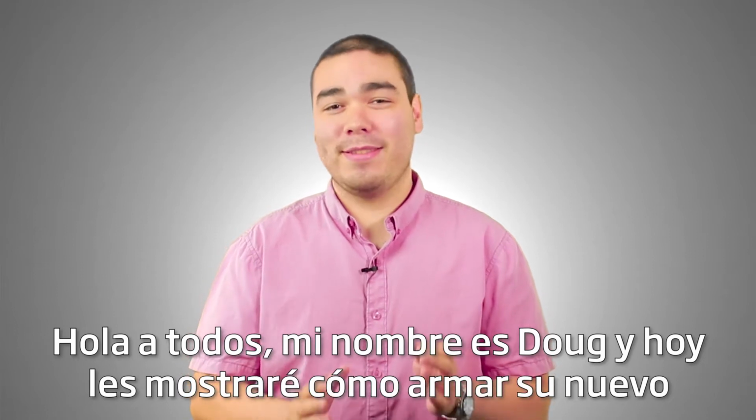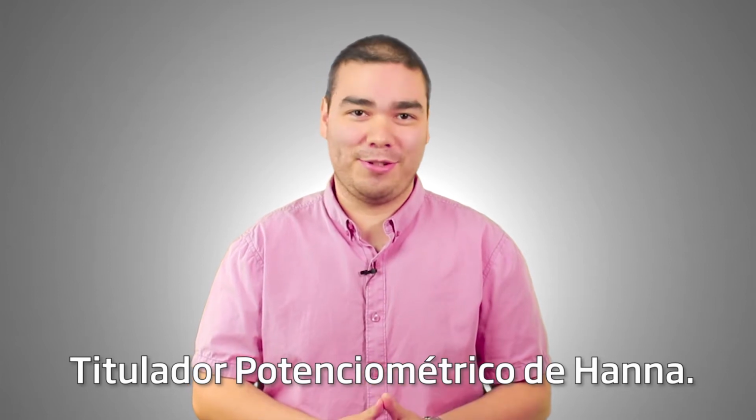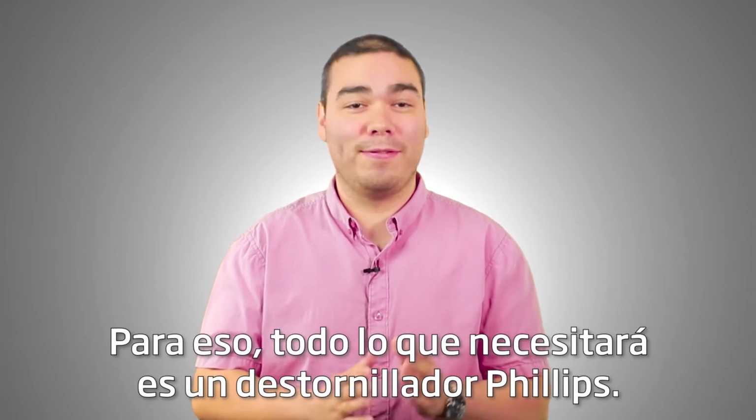Hi everyone, my name is Doug, and today I'll be showing you how to assemble your new Hanna potentiometric titrator. For tools, all you'll need is a Phillips head screwdriver.